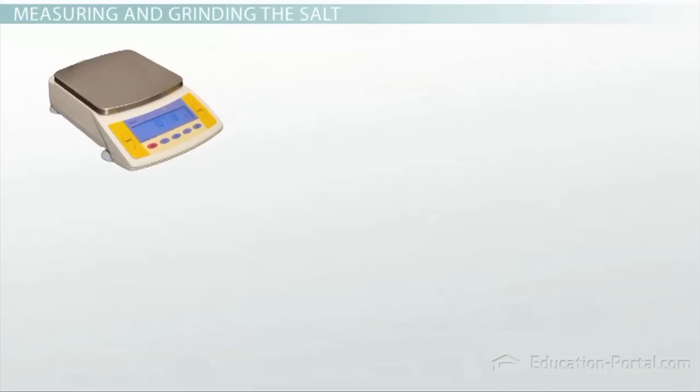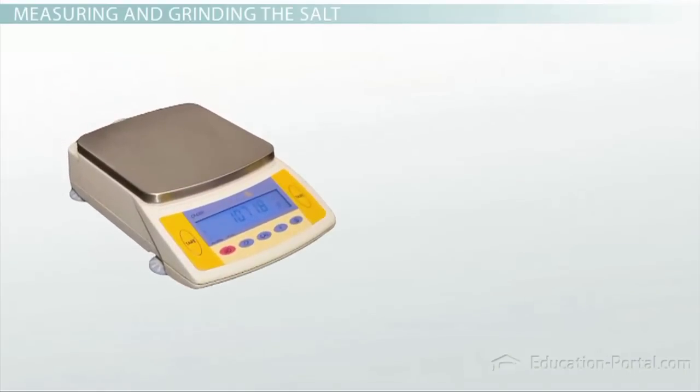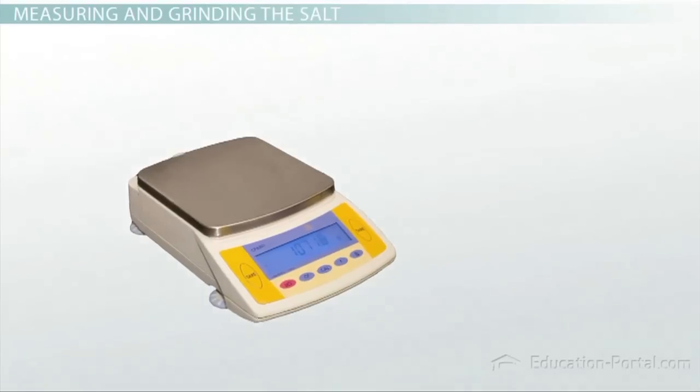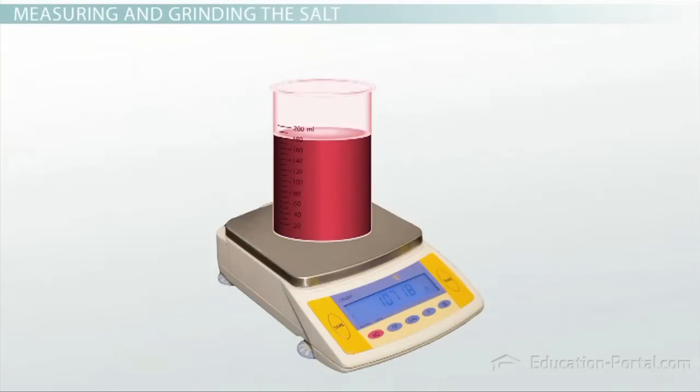Our first stop is a common piece of equipment, a balance. A balance is used to determine the mass of a substance. Often times you would first measure a substance's mass, then react it with something, and then measure its mass afterward.